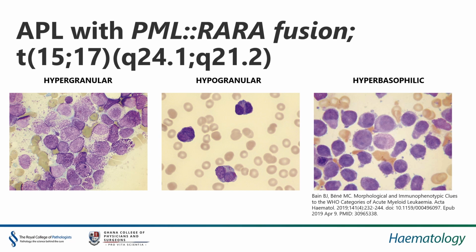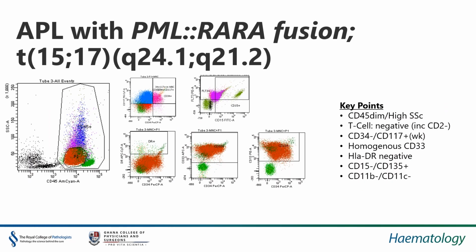So immunophenotyping can be considered by some as unnecessary in acute promyelocytic leukemia. And I would somewhat agree. I think the most important diagnostic test in acute promyelocytic leukemia is obviously the PML-RARA. However, the phenotype is very characteristic, whilst sometimes slightly tricky.